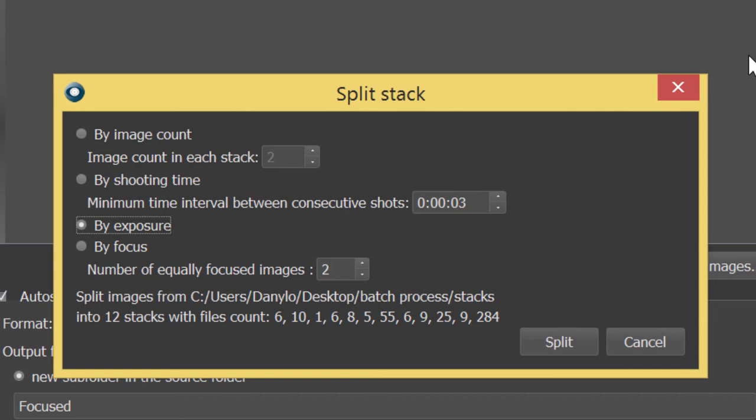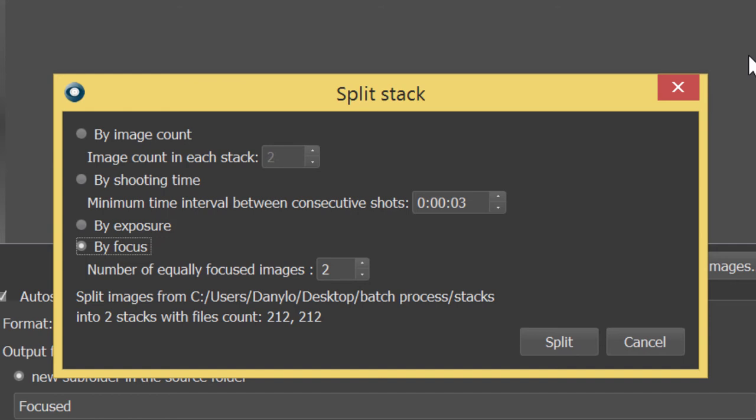The fourth splitting principle should be chosen, for instance, if you want to merge the first image with the eleventh one, the second with the twelfth one and so on.